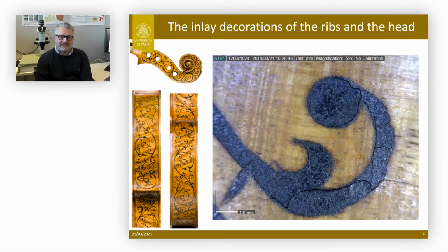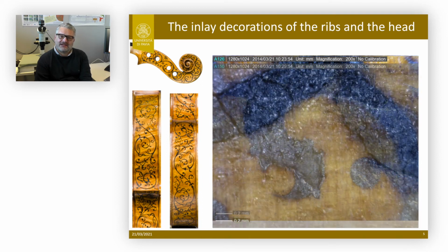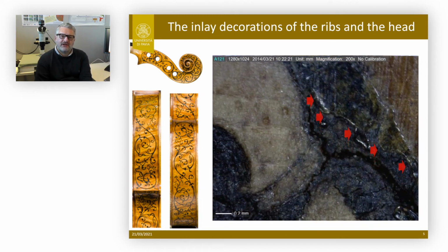Even during the study of the inlays of the ribs of the instrument, it was important to discriminate the layers of varnish and the materials that were used to fill the inlays. And as is possible to see here, we have an overlay of the natural original varnish and the purfling and inlays.